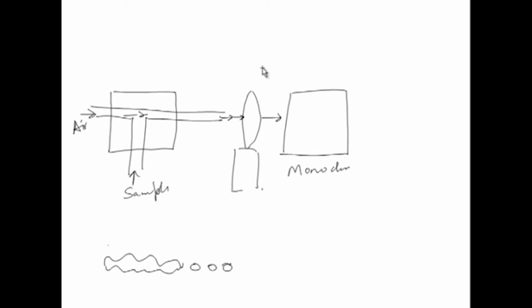Once it is in here, there is a flame at the particular right part of the flame, and the flame is put with laminar flow, so that it is properly oriented. Then the sample is introduced into the flame, where the excitation process and then emission occurs. This is then recorded; it is passed through a monochromator. The monochromator will allow only certain wavelengths to pass through. Then after the monochromator there will be a detector, and from the detector there will be a readout.